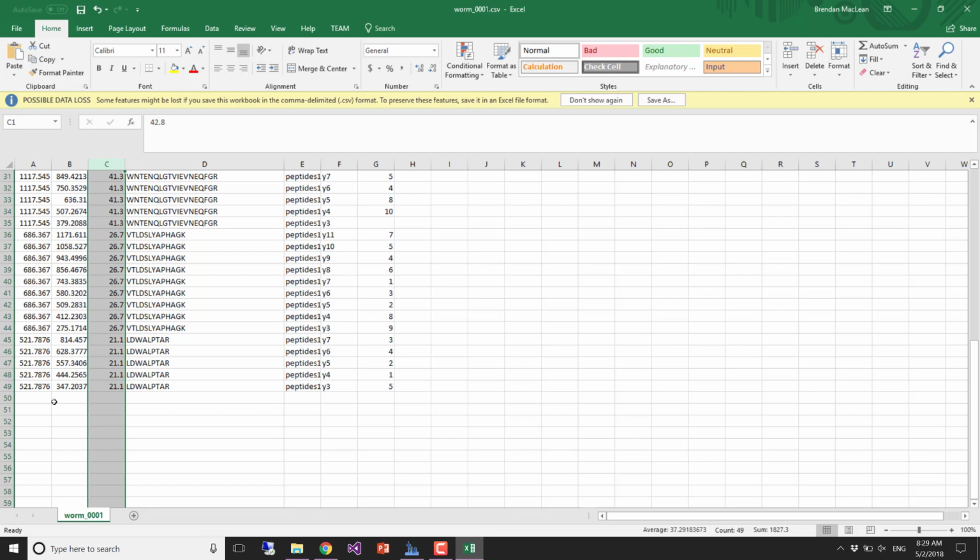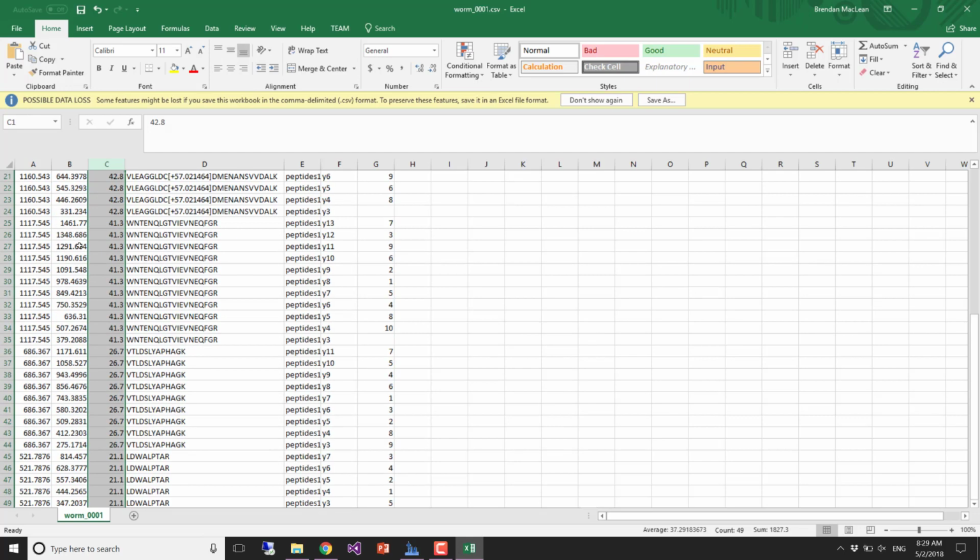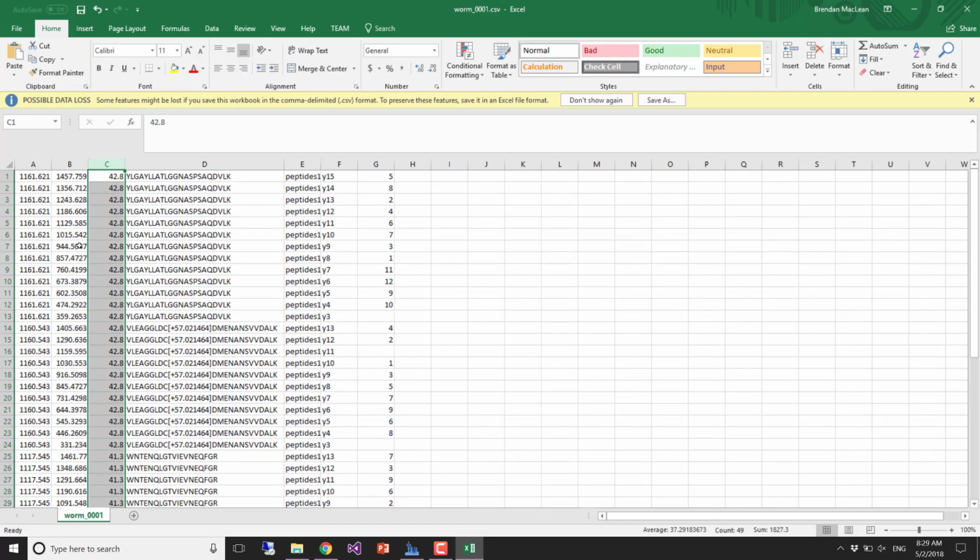and the next peptide must have more than 10 transitions to measure. So Skyline's just walking down the list, and anytime adding another peptide would give it more than 59 transitions, it breaks it into another file.